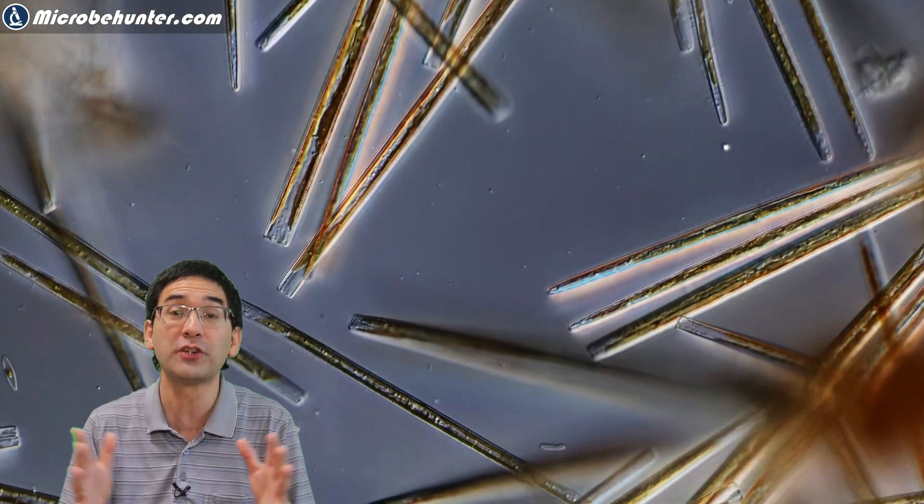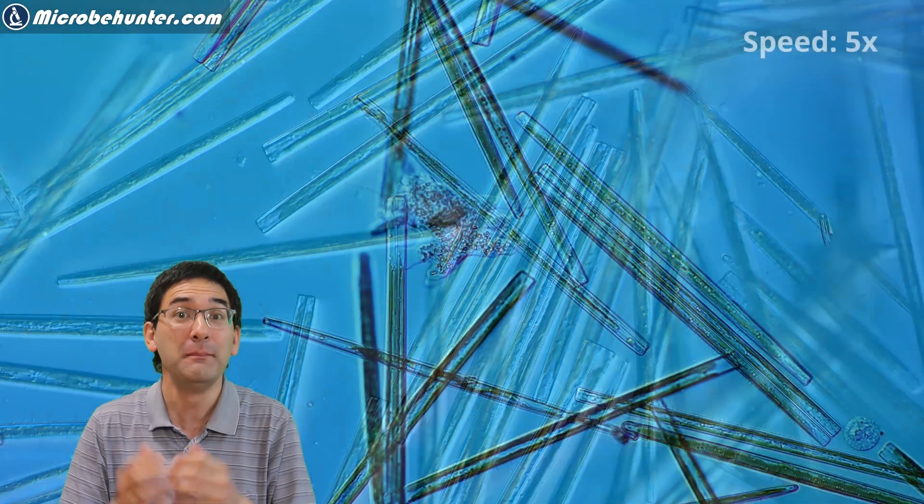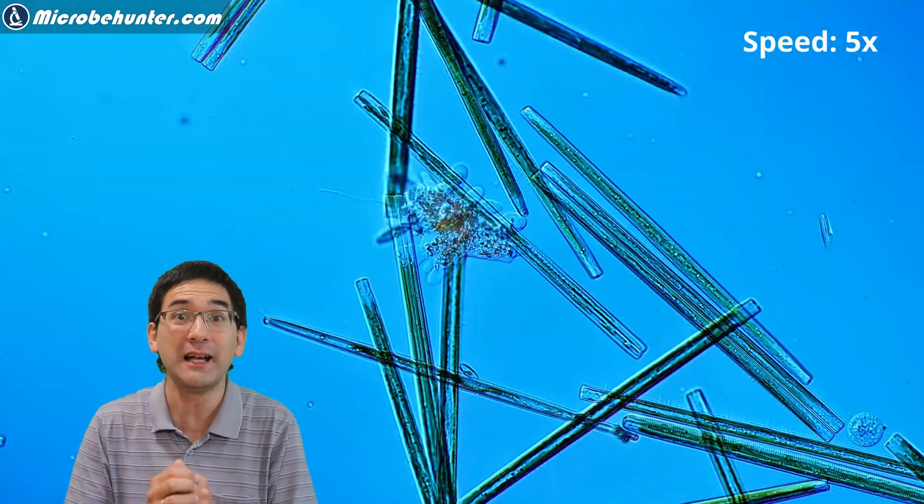Most of them were quite large and quite long, and the smaller diatoms that were present, well, I found many of them actually inside those amoeba.